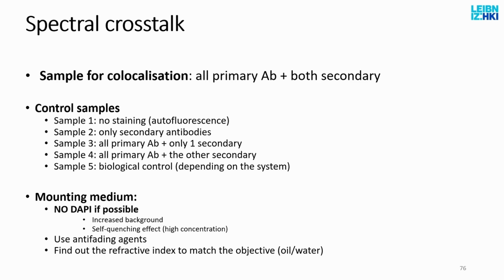Just imagine you have a tissue or a multi-layer of cells. You have to focus 50 micrometers into the sample, so it's far from the cover slip. What will the light do?